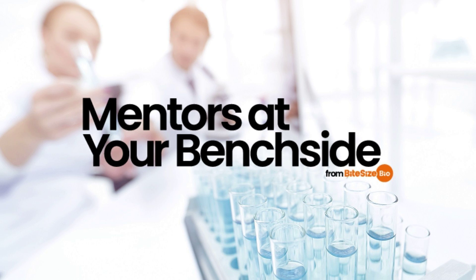How do you win a Nobel Prize? A good deal of brain power, definitely. A dash of foresight and bravery to stake your research career on a legitimate frontier helps. A splash of insight to ask the correct questions at the risk of ridicule is a must. And serendipity certainly helps. Cryo-electron microscopy, or cryo-EM for short, entered the mainstream seemingly from nowhere when it won the Nobel Prize for Chemistry in 2017. Furthermore, the choppy blend of questions, results, and timing that chart its rise makes for an intriguing tale.